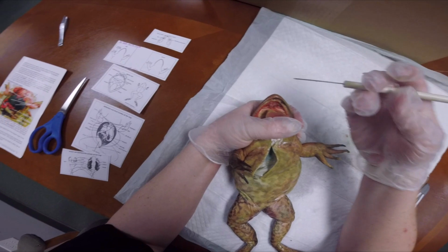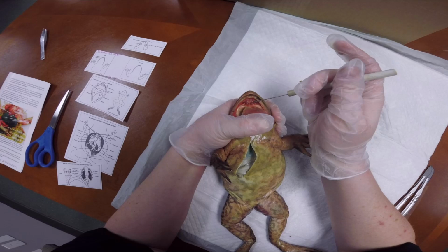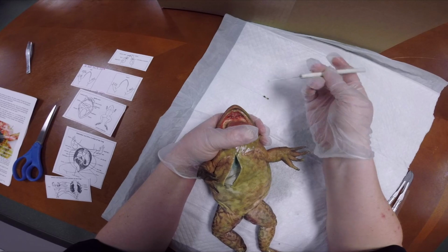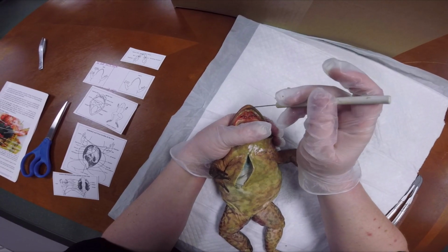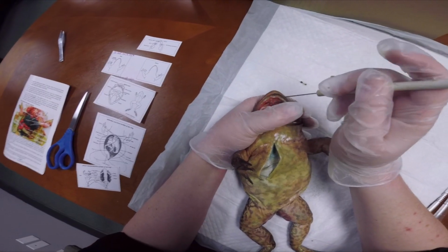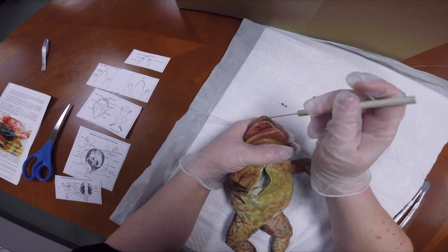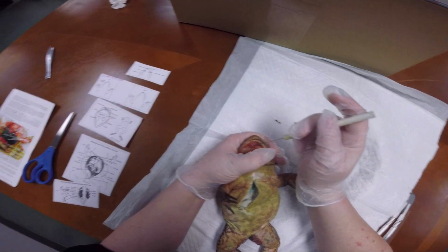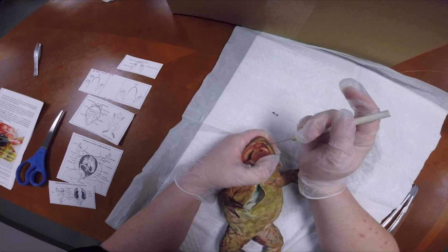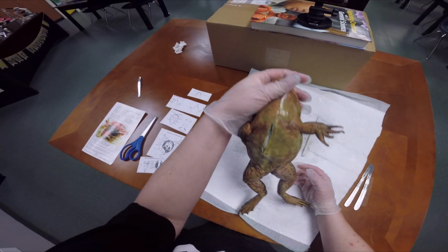In the top part of the frog, you can see the vomerine teeth, which are these two guys right here. If you stick your glove in the wrong way, these are known to break gloves. Then on the top up here, those are the maxillary teeth. The maxillary teeth go all the way from here, all the way across, kind of like our teeth. But then they have the two that are back here, and those are the ones that I call the glove rippers because they're very sharp. If you're not careful, they'll get you. So that is the mouth.